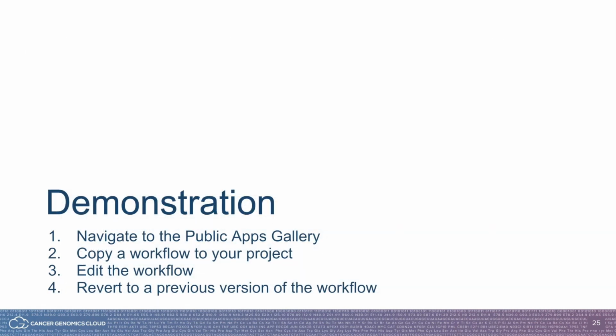In the platform demonstration, we will do the following. First, we'll navigate to the public apps gallery and we'll copy a workflow to your project. From there, we will edit the workflow, and finally, you'll see how to revert to a previous version of the workflow.